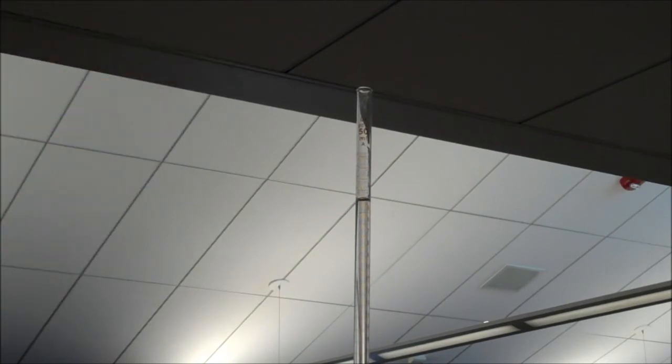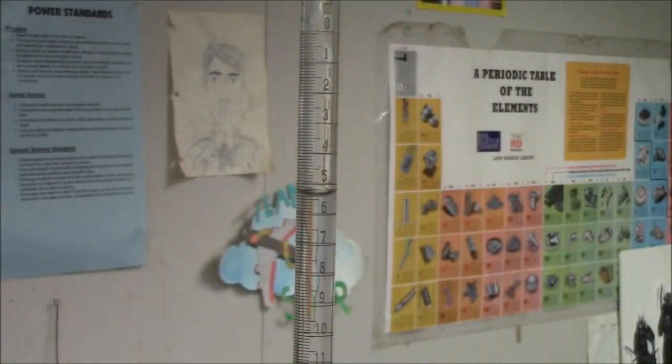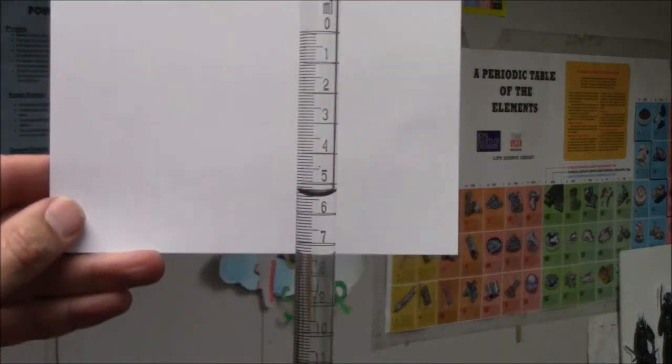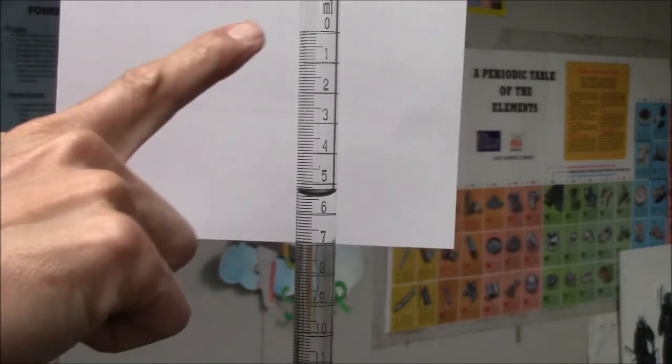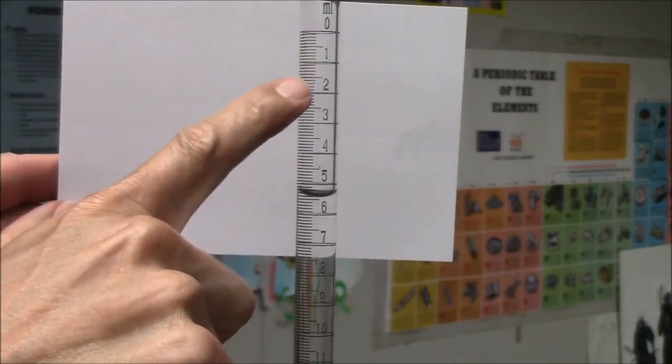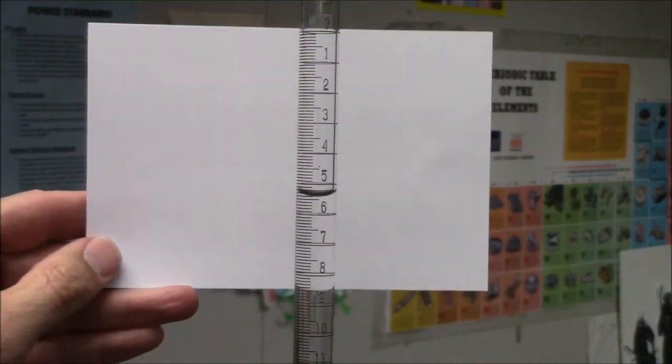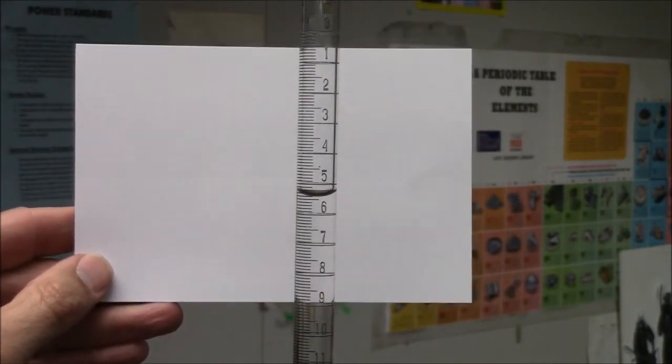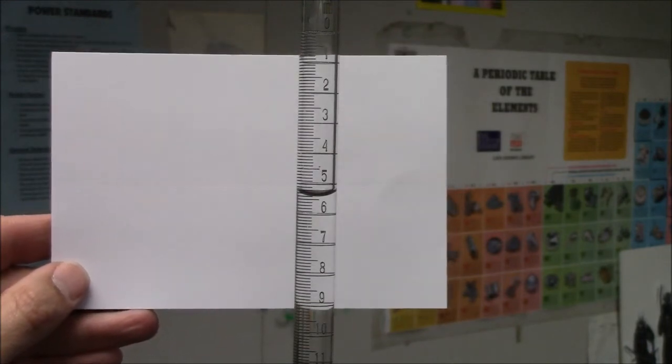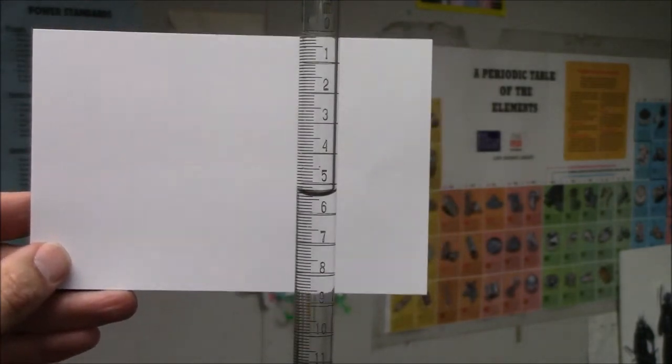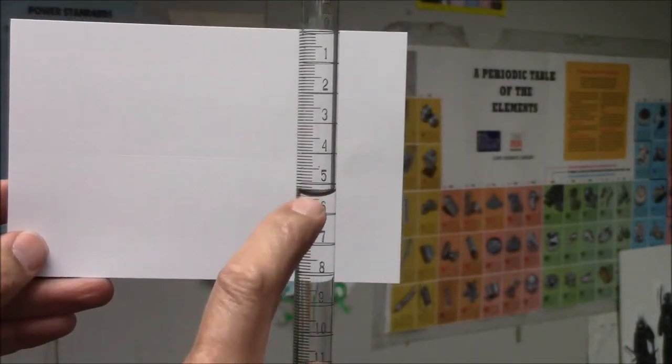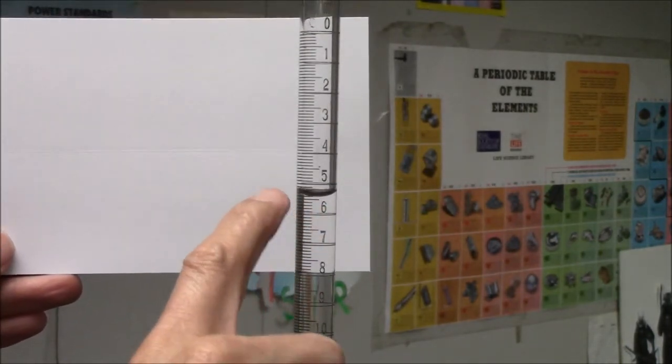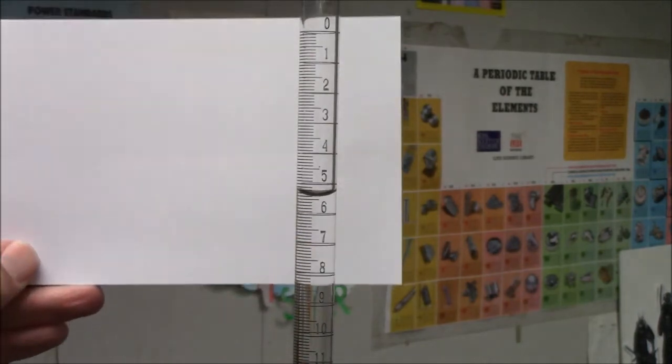Many students have trouble reading a burette because the numbers are backwards from what they expect. Zero is at the top. One, two, three, four, five. You do not need to know how much solution is in the burette. You only care how much comes out of the burette. So I read this as five point four milliliters. That's where we are right now. Bottom of the curve is at five point four milliliters.